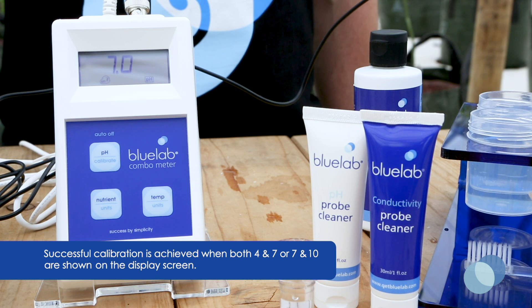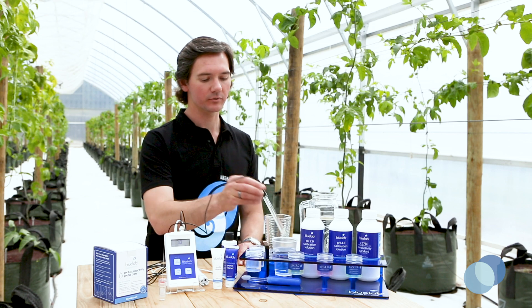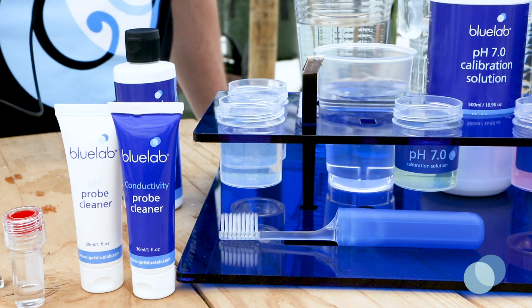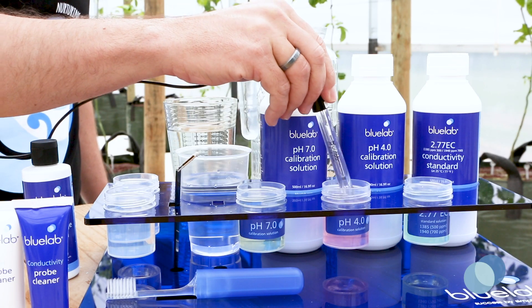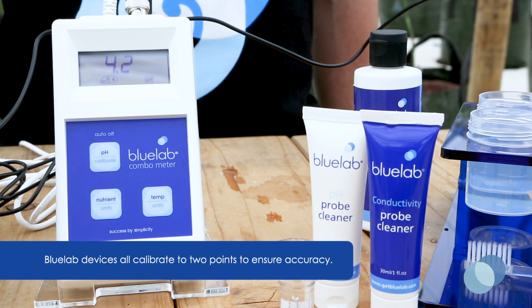You'll see the pH 4 calibration indicator flashing, letting you know it's time to calibrate in pH 4 solution. Next, rinse the probe in fresh, clean tap water. Then place the probe in fresh pH 4 calibration solution. Remember to give it a good swirl to ensure you've got good contact between the probe glass and the calibration solution.